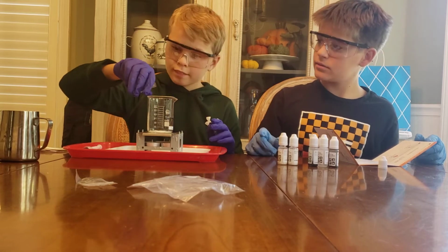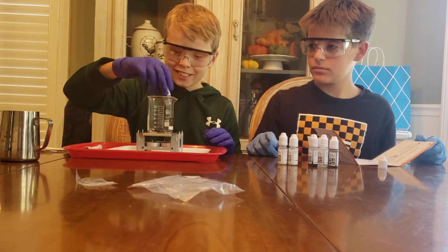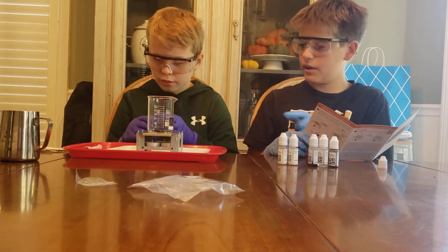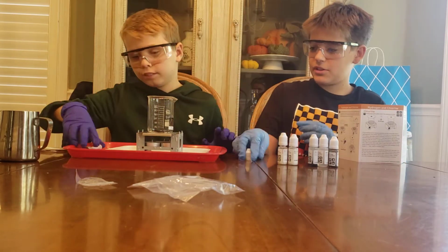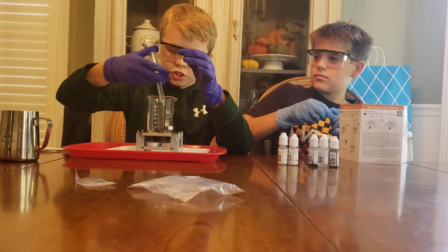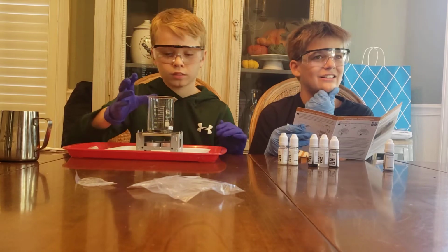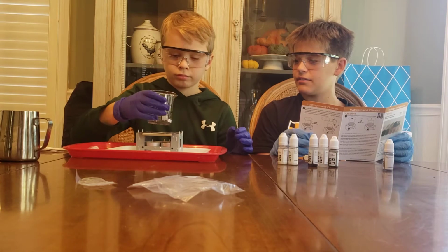Yeah. It looks like little seeds. So once you put the whole thing in, you're gonna have to put the syringe of water in. And also you have to have 3 milliliters in your syringe. And you're gonna have to mix it around. It doesn't say how long, but just mix it around until it looks like something different.